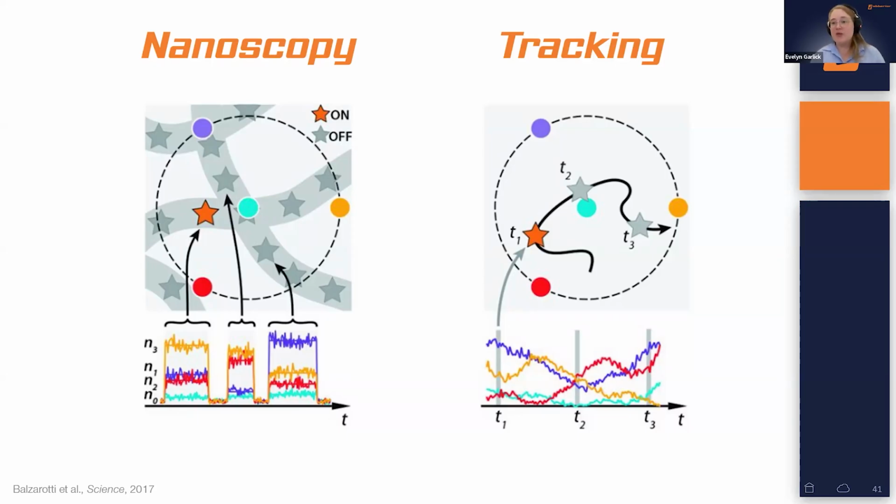And much in the same way that you switch from a 2D measurement to a 3D measurement, you can also switch to a tracking measurement just by changing that sequence that you're feeding into the microscope, telling it all of these complex settings, what to do with its EODs, what to do with its DM. All of that is done via just changing that drop down. So tracking is, of course, one of the real cutting edge parts of MINFLUX.